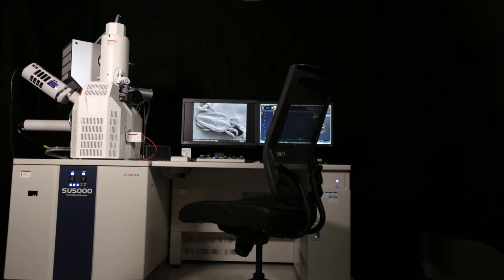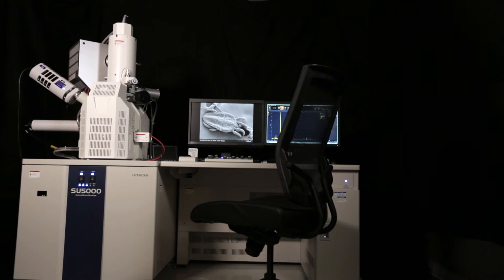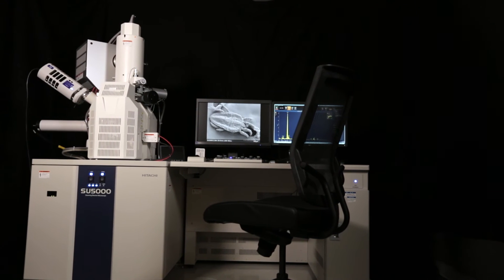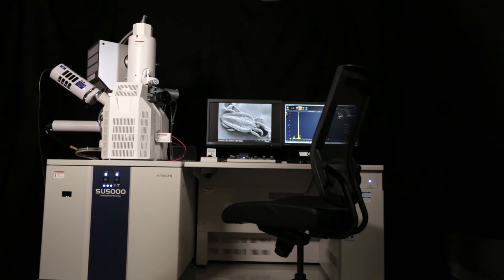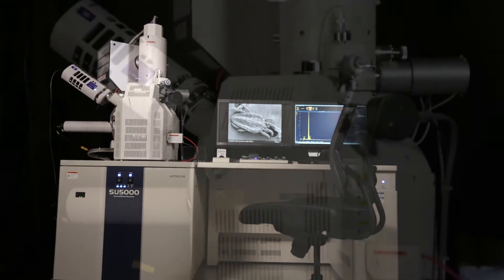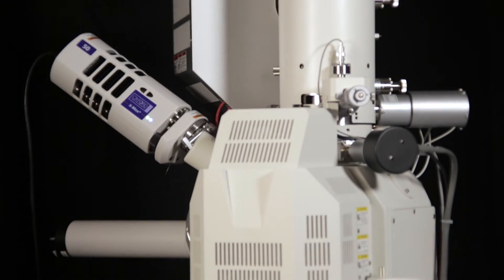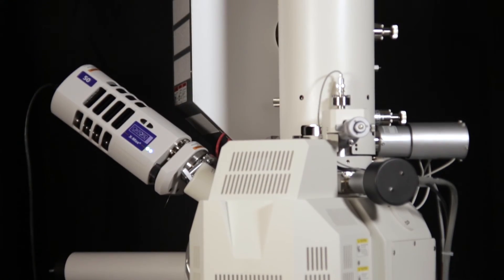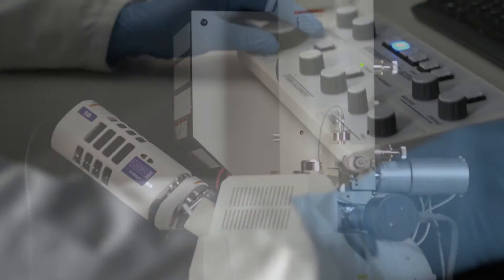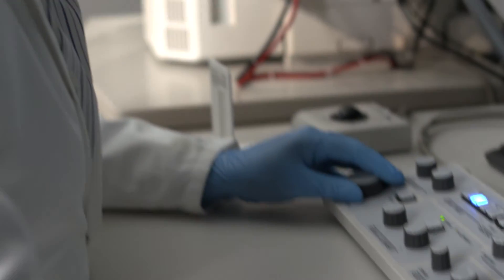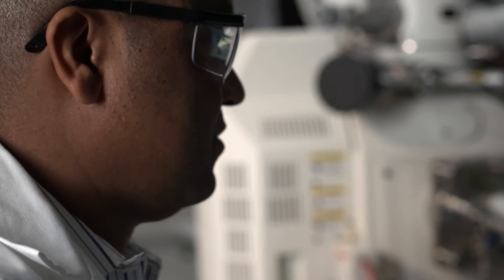The needs of the modern researcher require ease of use, versatility, and multiple functionality. The SU-5000 variable pressure field emission scanning electron microscope with EM-Wizard provides just that.